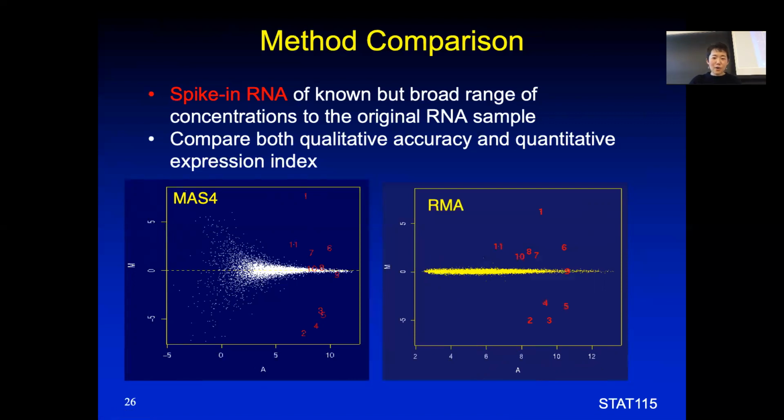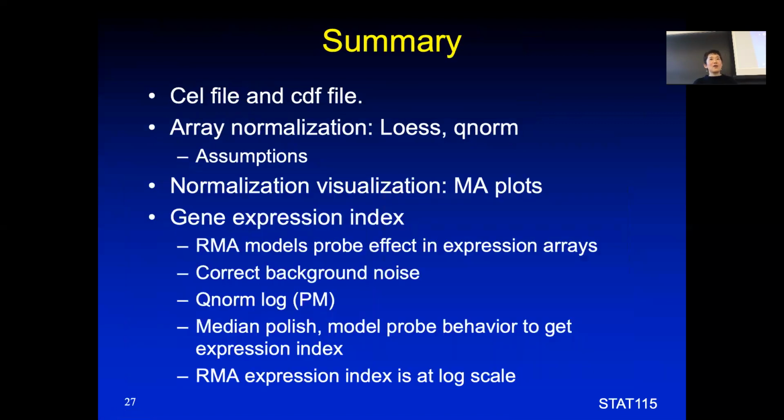Okay, so now with an Affy array, you will get a big matrix. Each of the rows is a gene or a transcript, depending on the CDF, and each column is a sample or a condition, right? So you'll get a big matrix of numbers, which is more manipulable, more understandable. The original CEL file can be a text file, which is bigger, but you can also zip it into a kind of binary file. But that file has like 6 million rows, which is impossible to read, right?